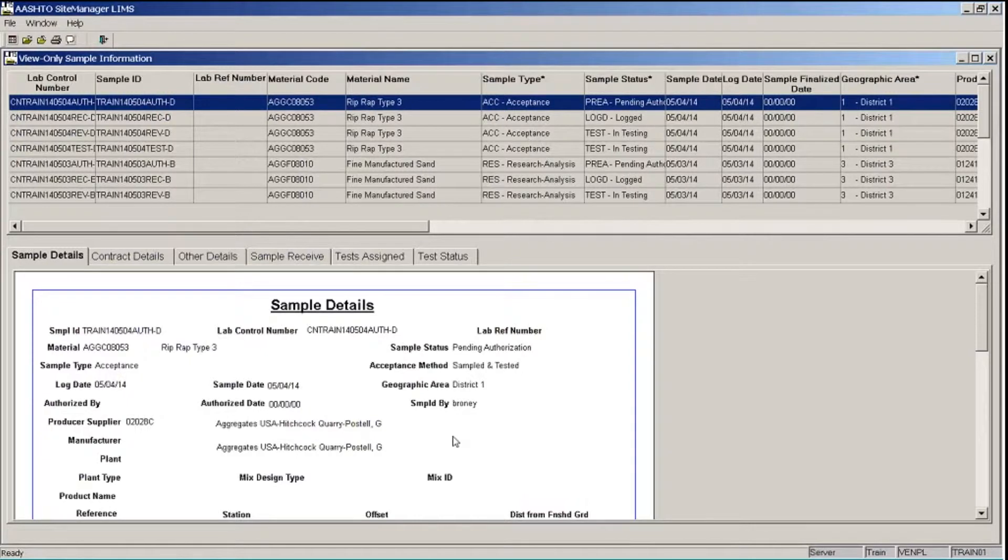Site Manager LIMS displays only the samples that were logged by users containing Train in their user ID that are associated with my organization.